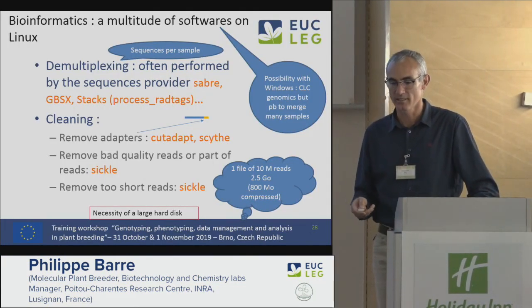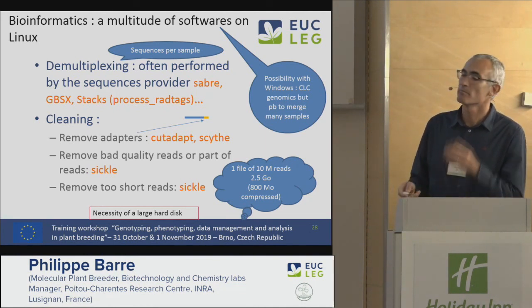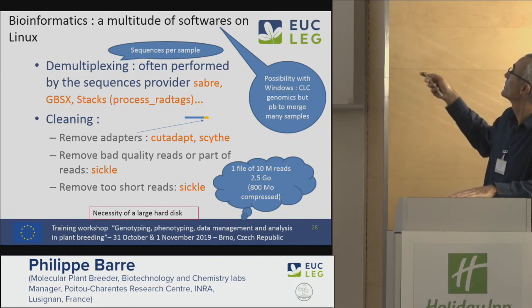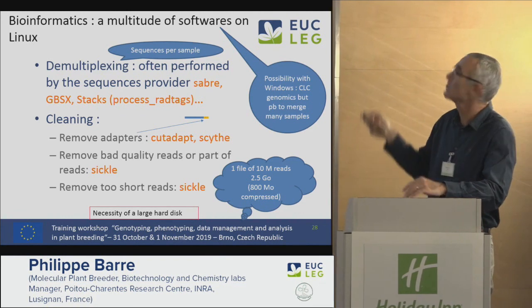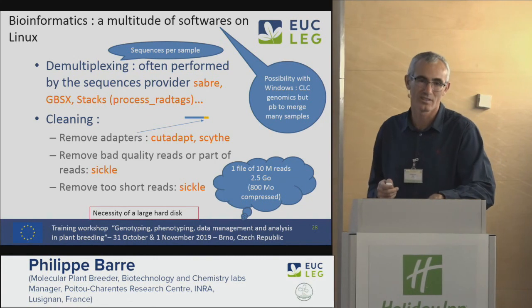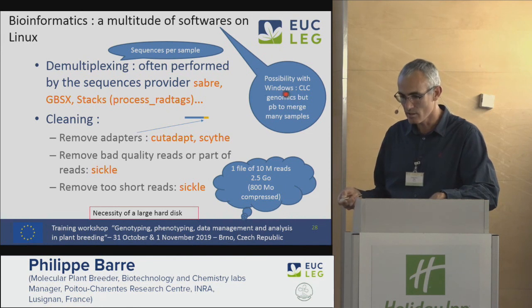So, bioinformatics. The idea, first, you see what I put here, it's a multitude of software, and on Linux. A multitude of software, so you have quite a lot. Some are more used than others, but you have quite a lot of software. I put here a little something.